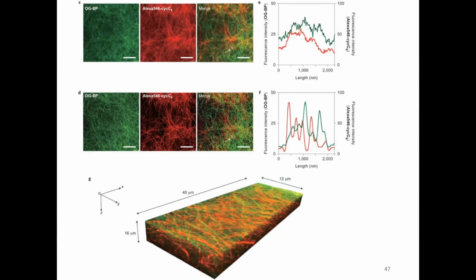So STED is just like confocal microscopy. You can also image in 3D, but at much higher resolution. So we can really start seeing, well, this phenomenon would only be visible with very high resolution imaging. Otherwise, you would just see a combination of those two colors together.